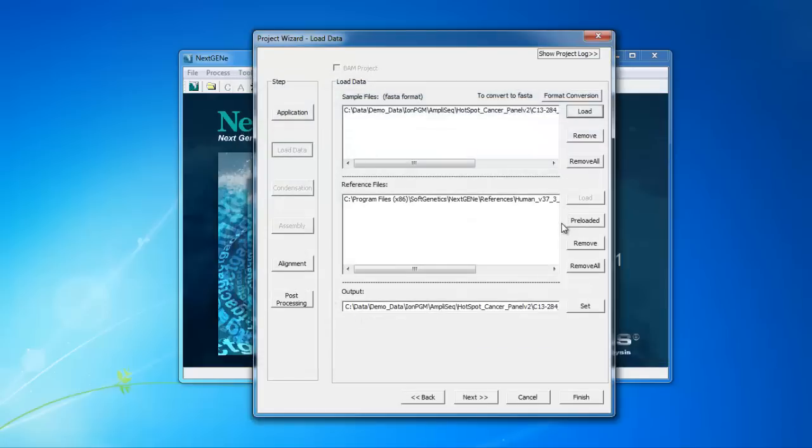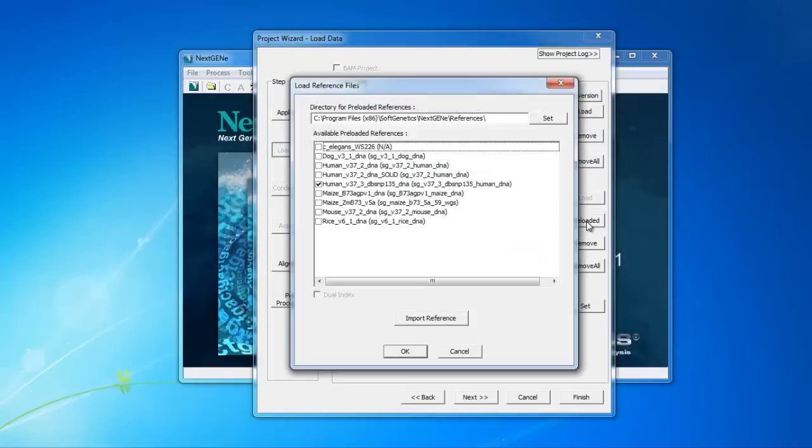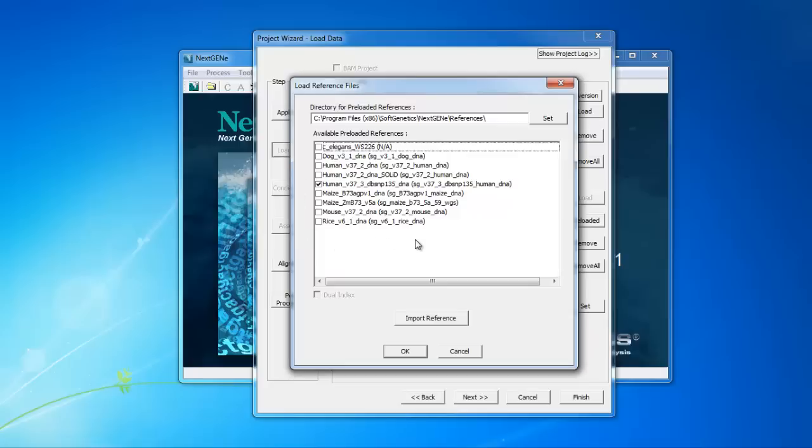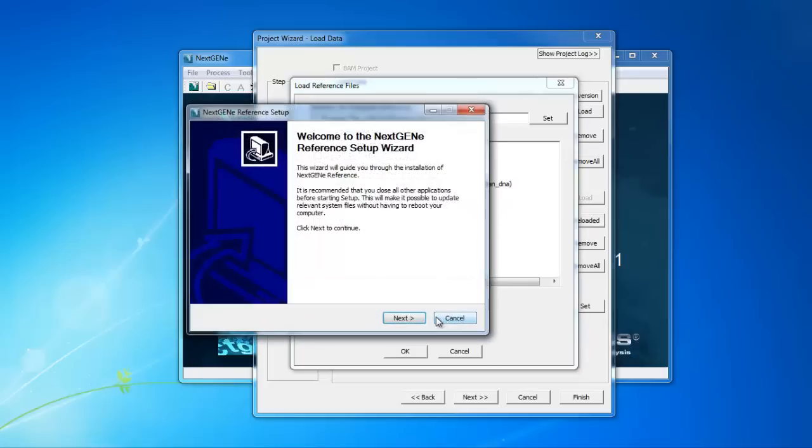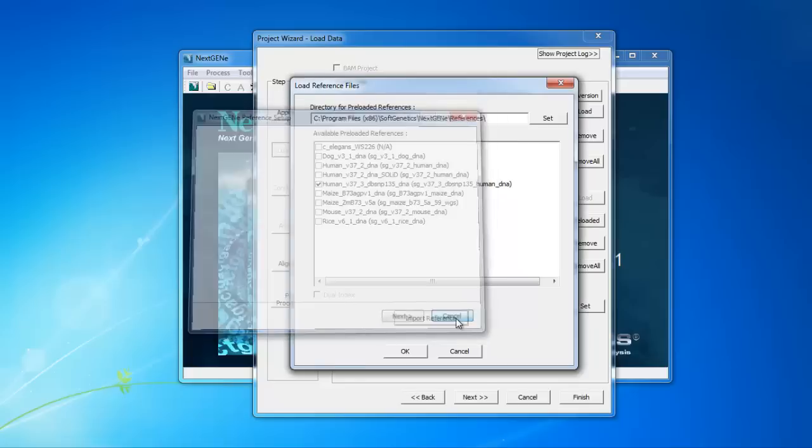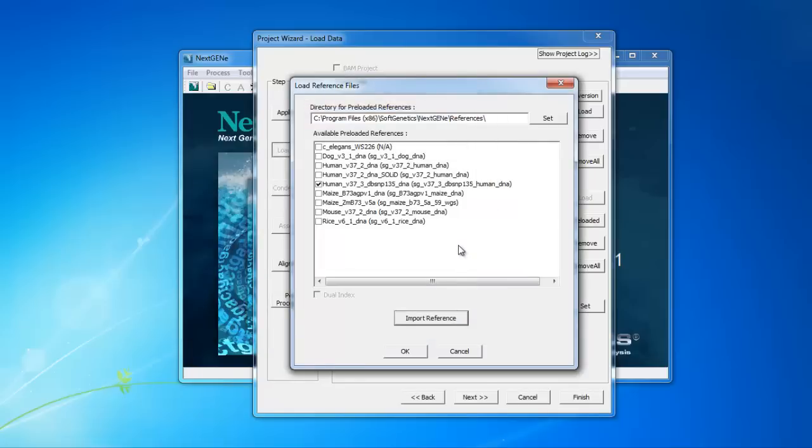Under Reference Files, click Preloaded to select the Human Genome reference file. If you haven't already imported the reference genome, this Available preloaded references field will be blank. To import the reference genome, click Import Reference. The NextGene reference setup wizard is opened, which will walk you through importing the reference. Once the reference has been imported, you can just click the box next to the appropriate reference and click OK.